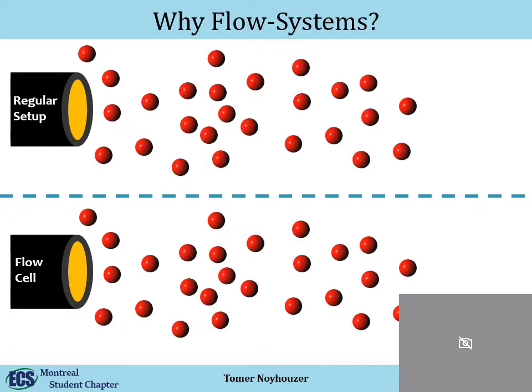So a lot of people are actually asking, why do I want to use flow systems? Because once you design a flow system, you're adding more layers of complexity to your original system, and you're making your life harder at the beginning. So flow systems, especially in electrochemistry, have a lot of advantages.